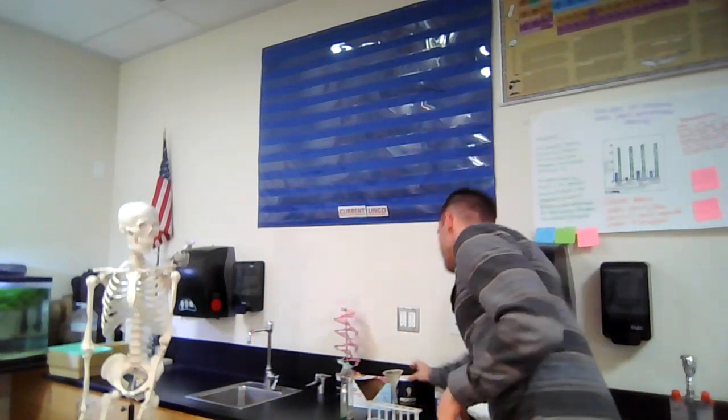All right. We also have salt in this extraction buffer. I put a little salt in there because it makes it more gritty and abrasive. That helps give extra friction and helps rip everything in the cell apart, because we just want everything to fall apart and get exposed into this big soup of cell stuff.